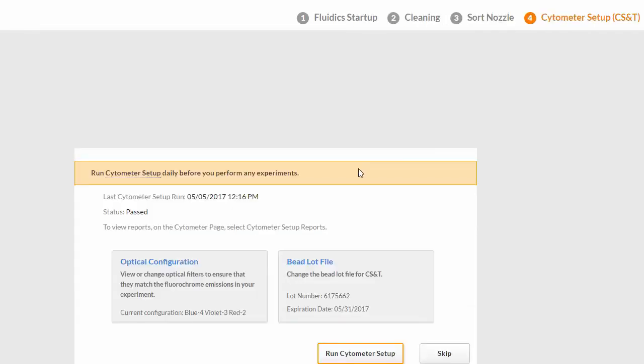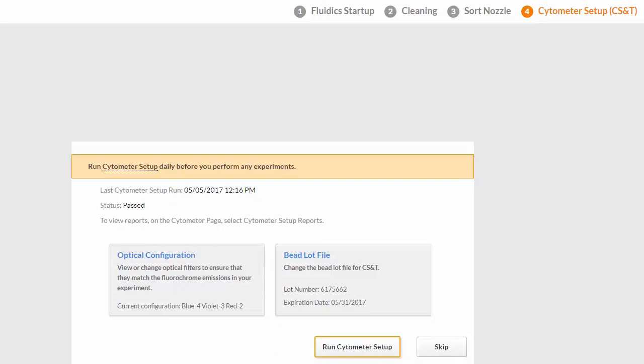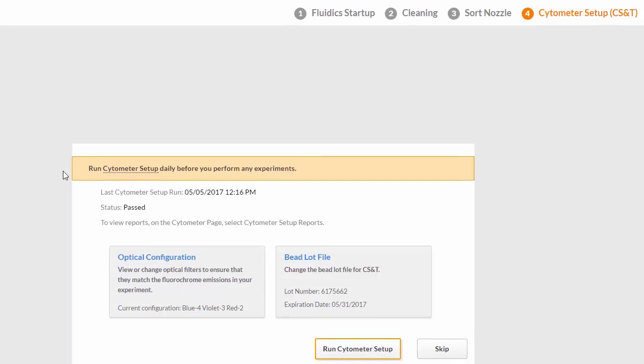The fourth step in the system startup procedure is to perform cytometer setup, also called CSNT. BD CSNT RUO beads are used to measure the baseline and daily performance capability of the instrument. We recommend running CSNT daily before performing any experiments. Prepare the beads according to package directions.